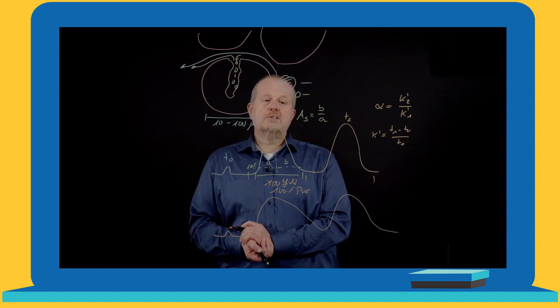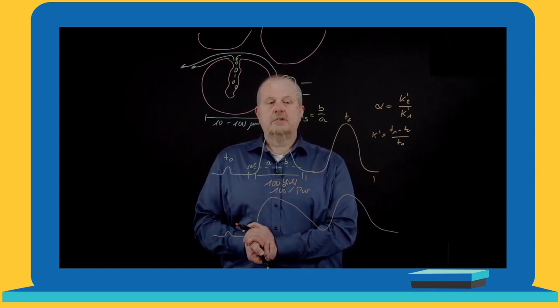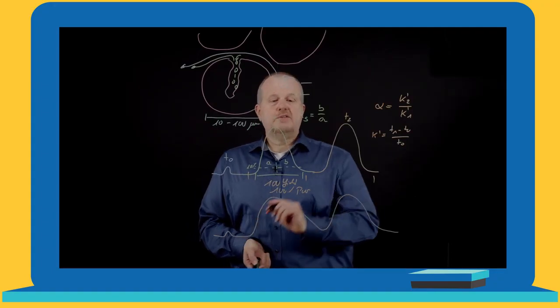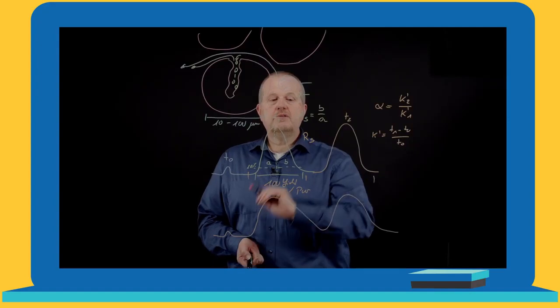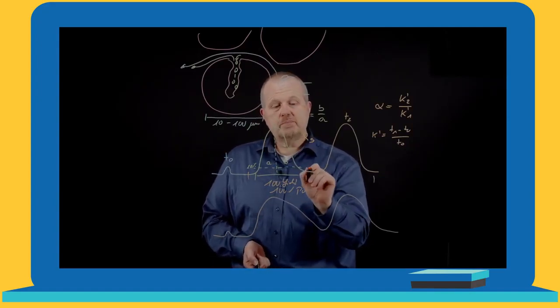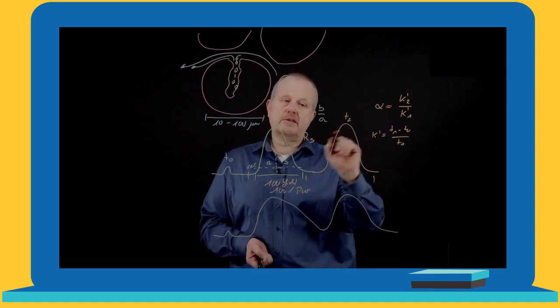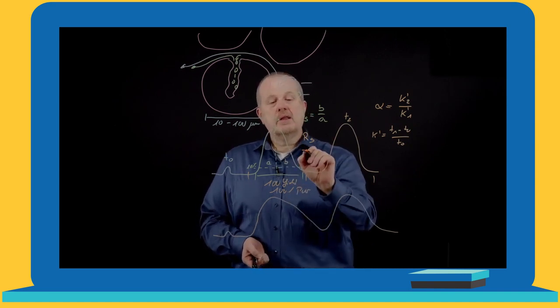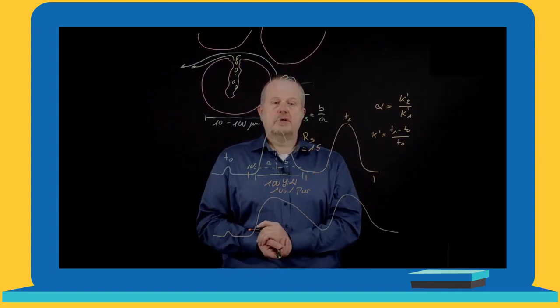And resolution is what is counting in preparative chromatography. Resolution is defined as the distance between the two peaks. If we have a separation where the UV signal goes back to baseline and then the second peak appears, then resolution equals 1.5.